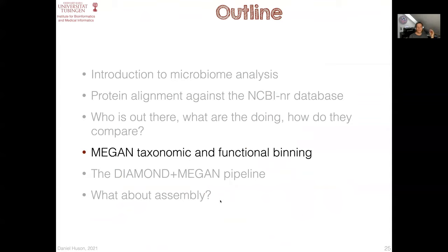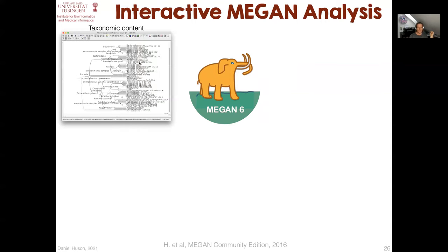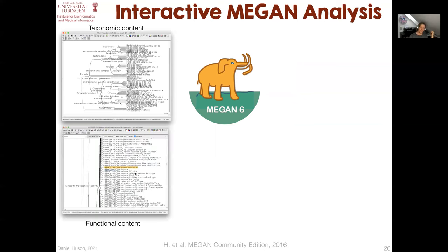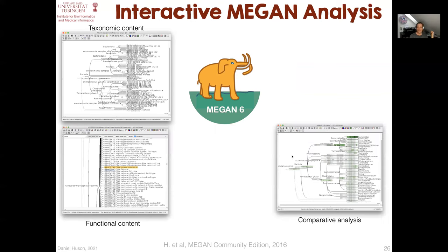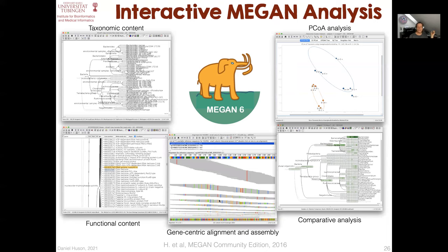MEGAN is an interactive tool that allows you to address these problems. It provides ways of exploring the taxonomic content of a sample, different ways of exploring the functional content, and you can compare multiple samples simultaneously in MEGAN. You can do calculations such as PCoA analyses of your samples, and there are many more advanced features — for example, so-called gene-centric assembly, where you assemble individual gene sequences rather than trying to assemble whole genomes.